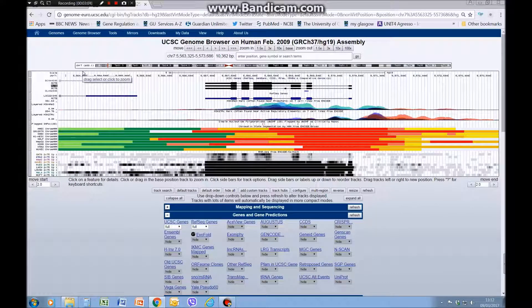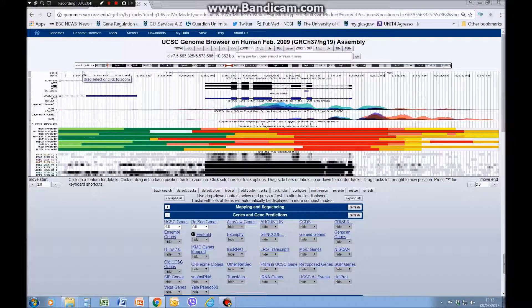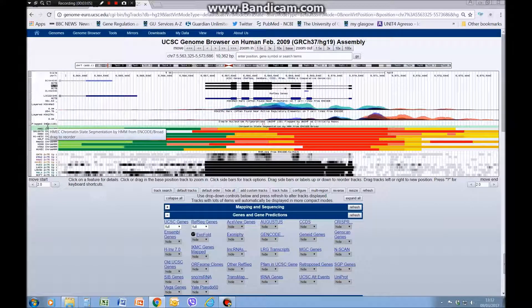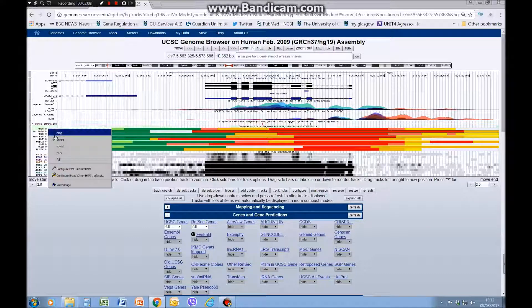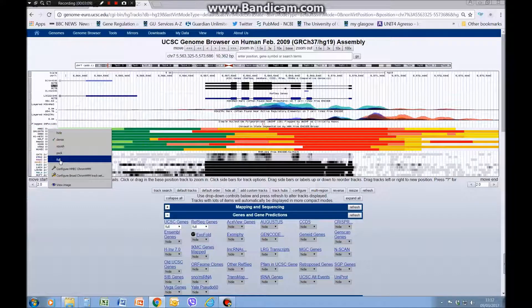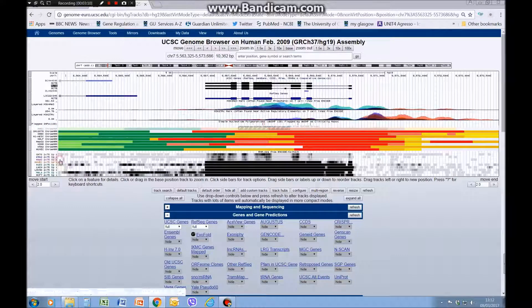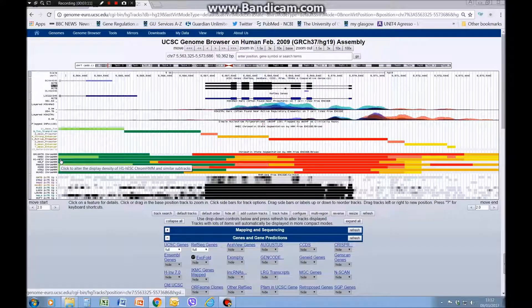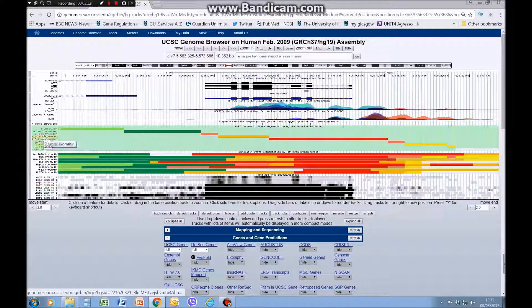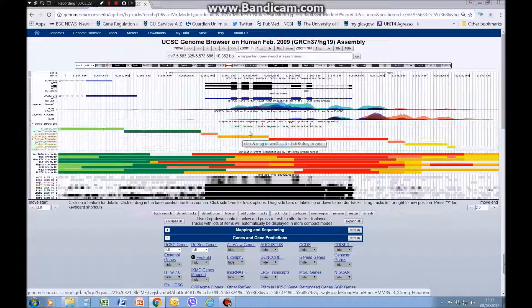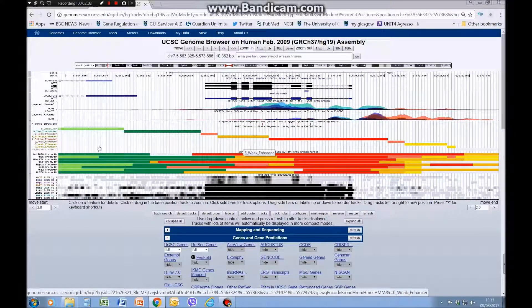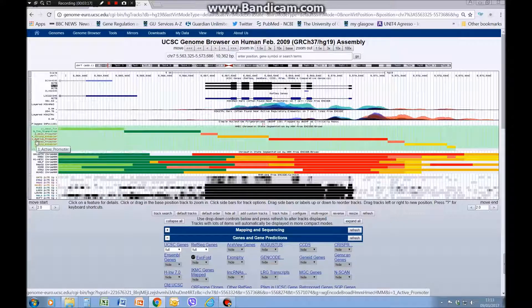So now we get a lot of colors, and to work out what the colors are you can right click and set it to full. It'll spread them out and now you see the key here. If it's red it means active promoter.